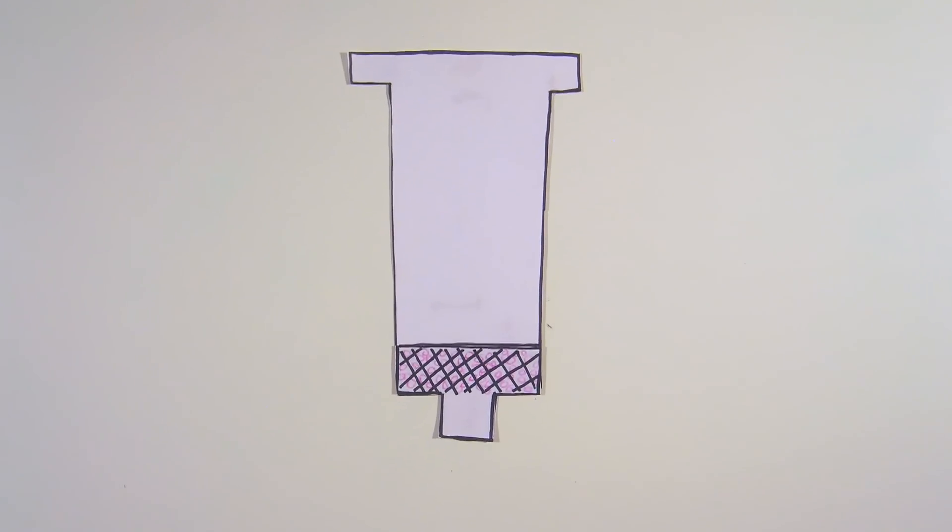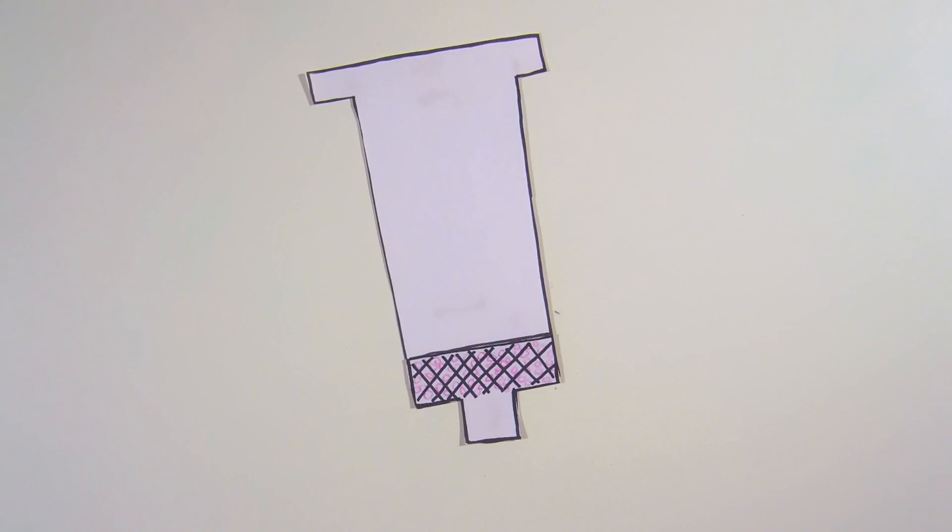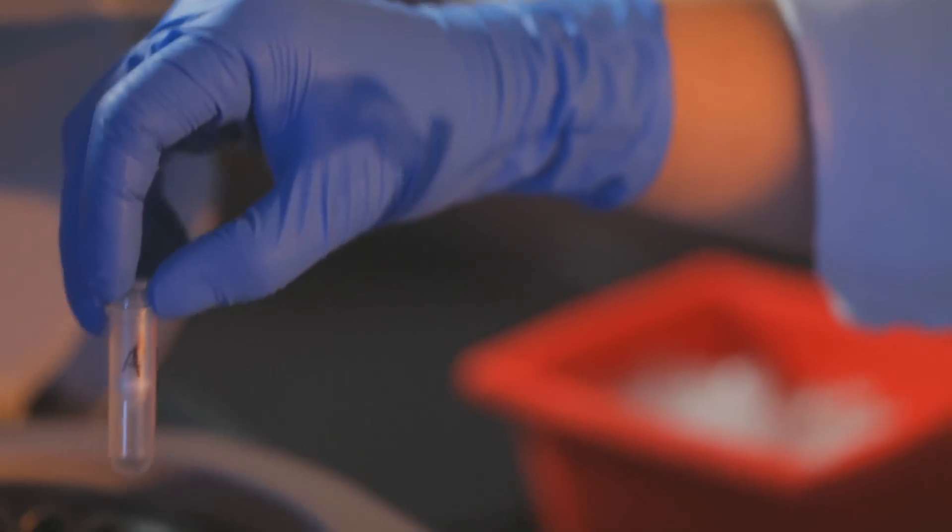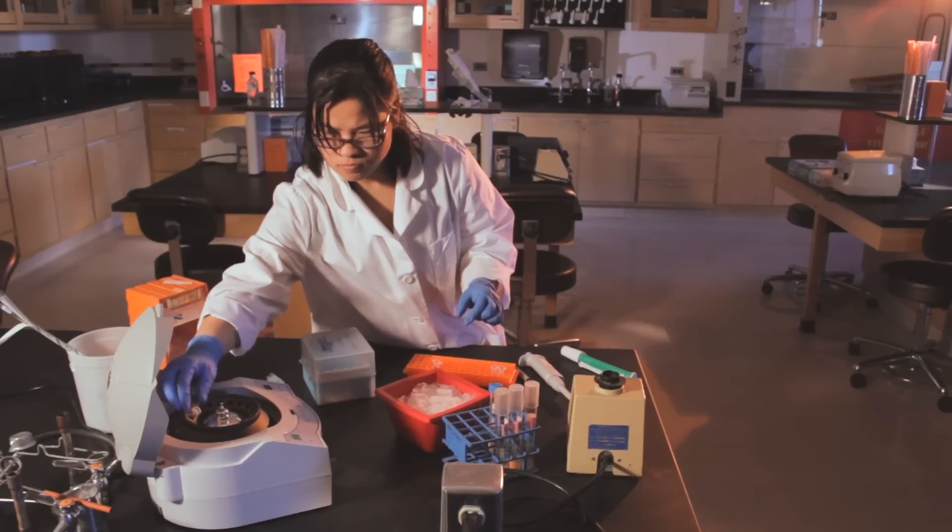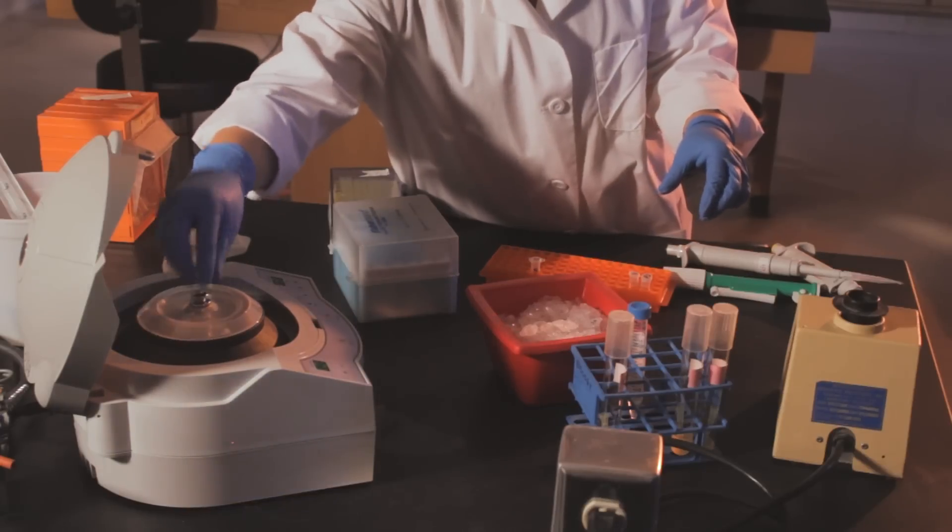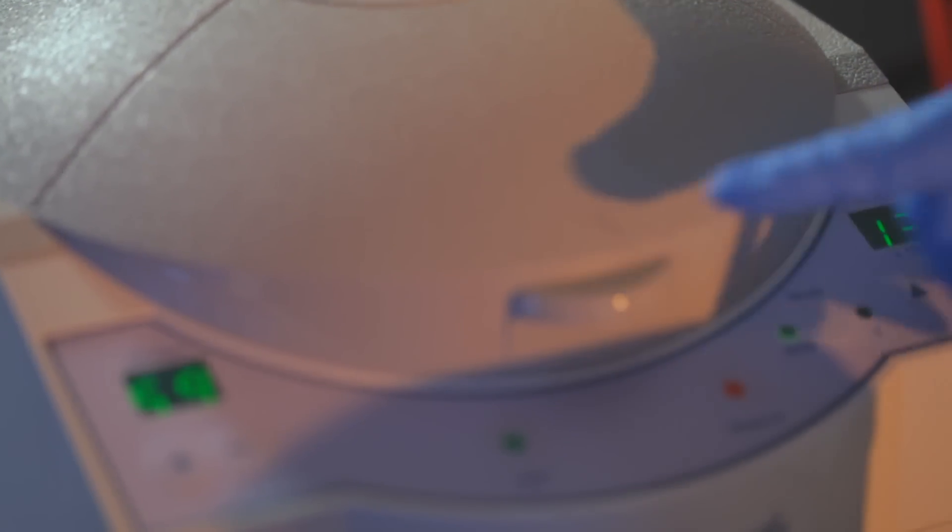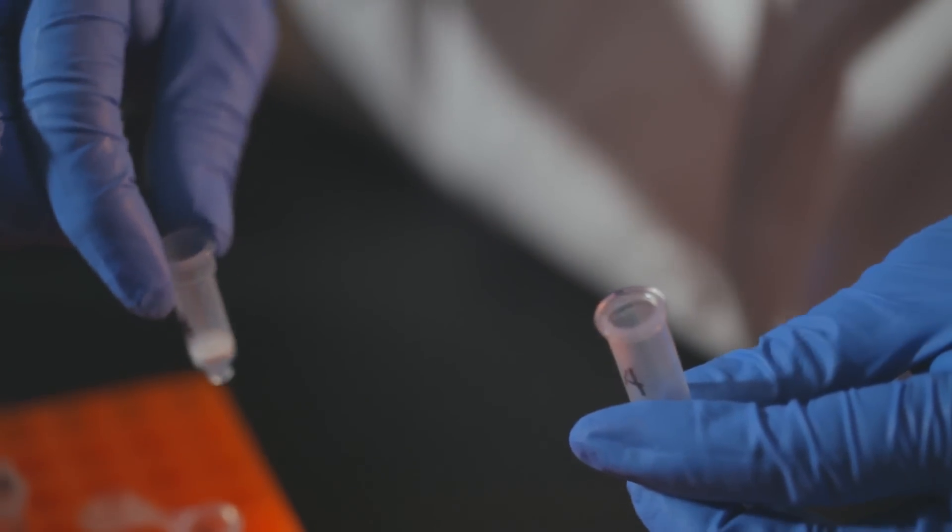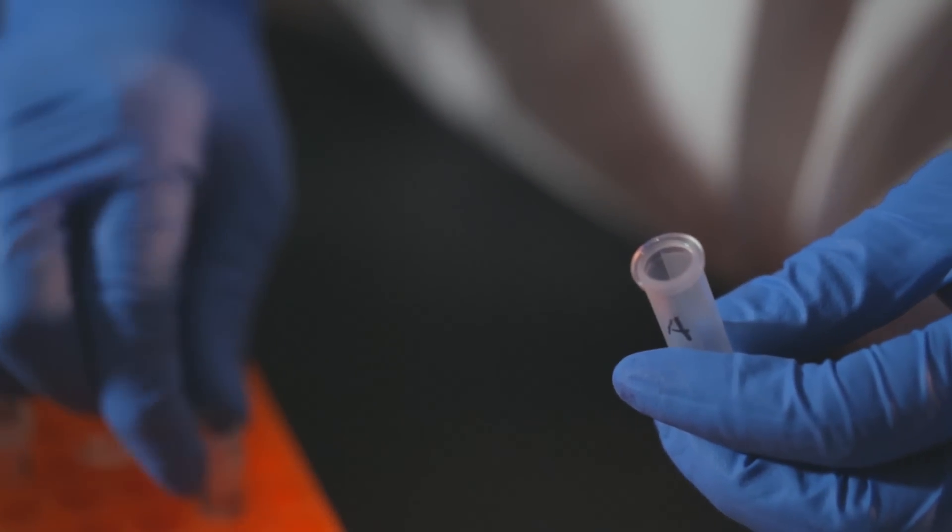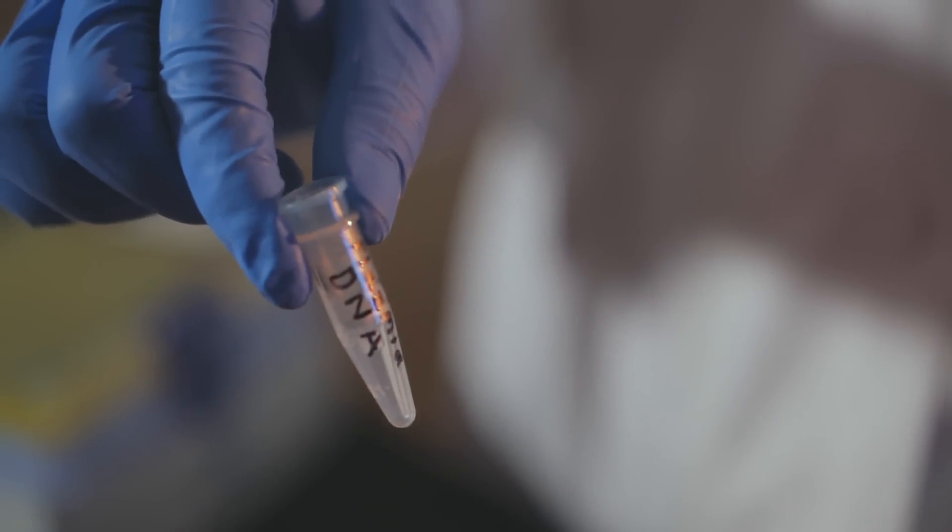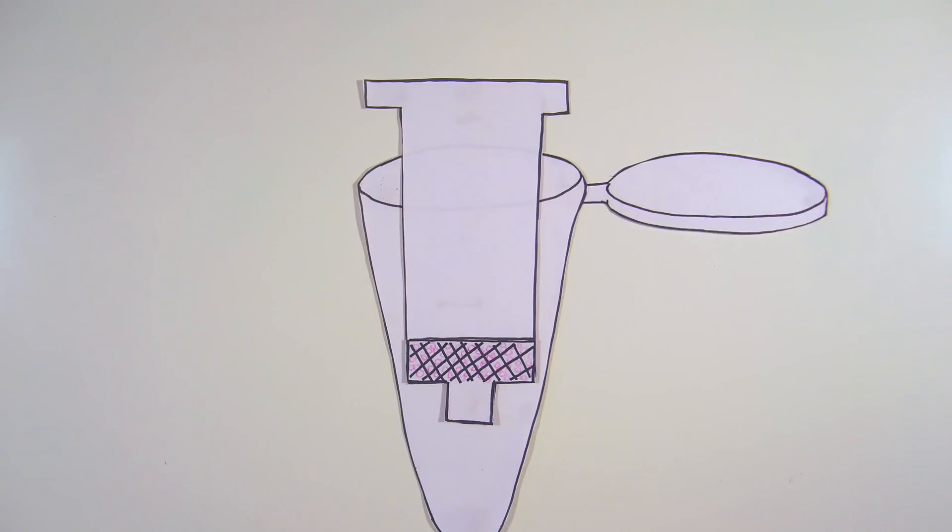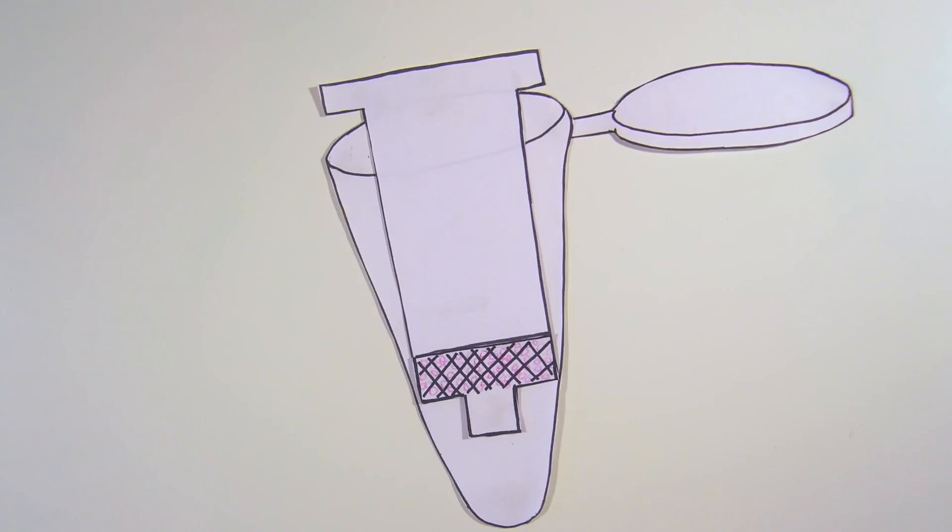Residual ethanol from the wash buffer may inhibit subsequent enzymatic reactions, so it is important to dry the spin column with a second spin. Centrifuge again for one minute to remove any residual wash buffer. When you are done, place the spin column in the clean, appropriately labeled 1.5-milliliter microfuge tube. Your plasmid DNA is still on the spin column. Discard the collection tube with any flow-through.